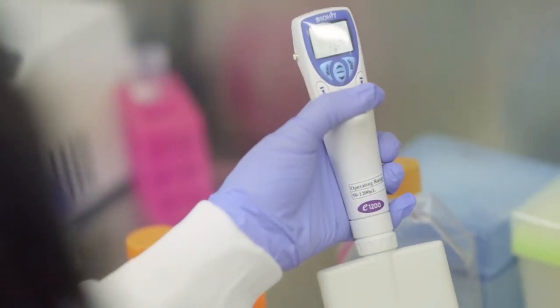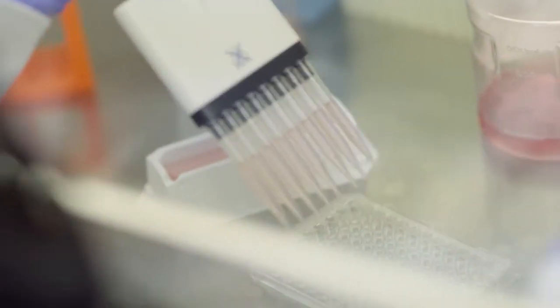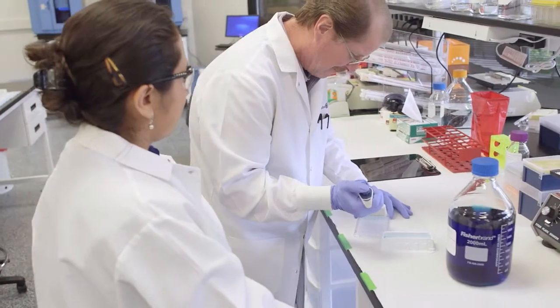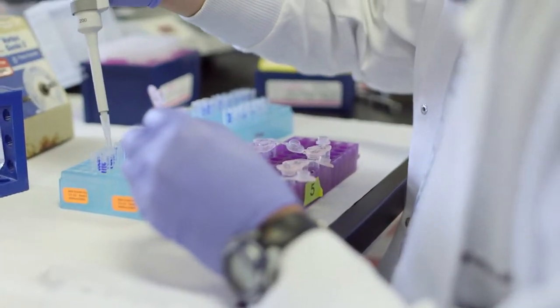As you can see, there's a near limitless variety of cell-based assay platforms that can be developed. Each cell-based model system has advantages and disadvantages, and a critical component of proper cell-based assay development is the knowledge and experience to weigh these considerations carefully to select the most appropriate model.